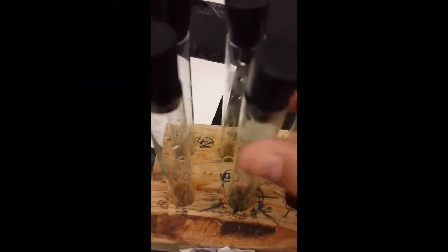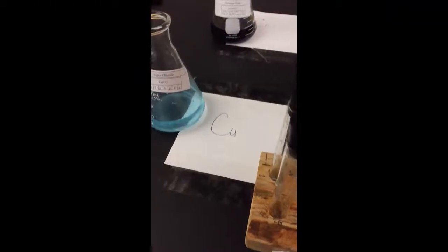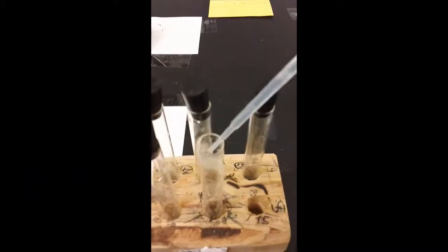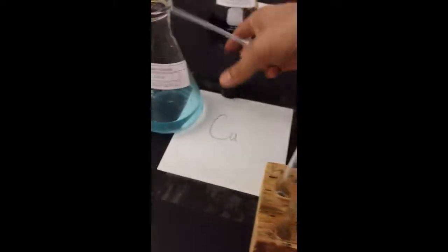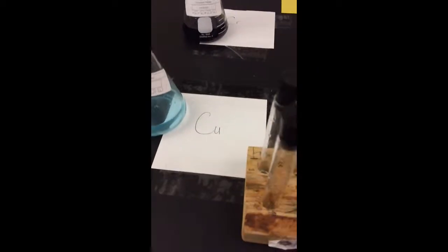On the other side of my block, I know it's a little bit hard to see, but this one here is Cu. So this test tube is going to be Cu, or copper. And that leaves my last one over here to be K. So my last one is K, and that's potassium. And these are ionic solutions that we're working with here.